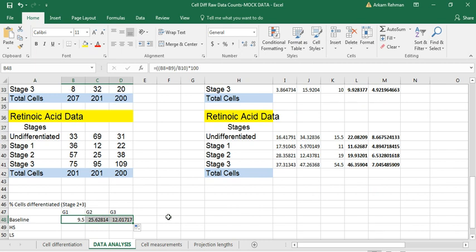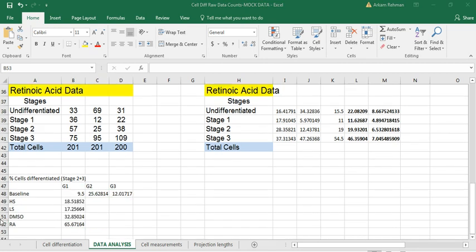And then you can pull over to get the number for the remaining groups, no matter how many groups you have. It could be 3, it could be 100, but all the groups you have can be used together in this manner. Okay, so now I've gone ahead and calculated that information for the group 1. I can drag it over and I have that information for everyone.